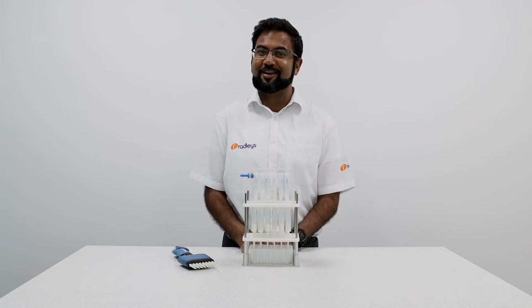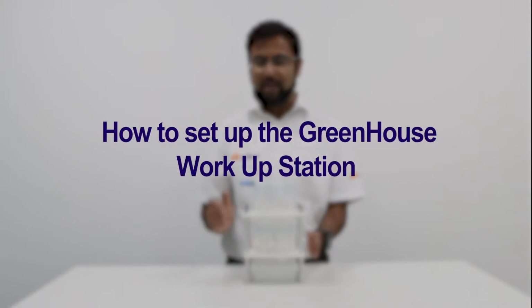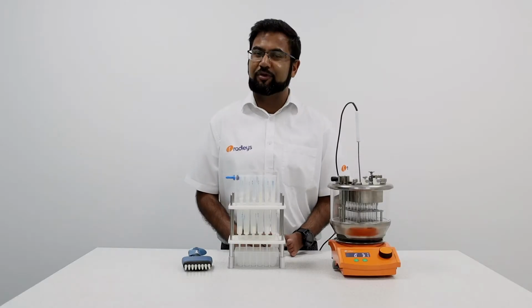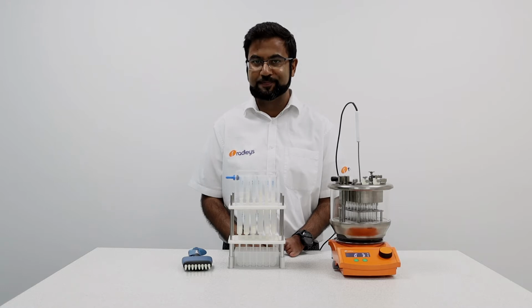Hi, in this video today I'm going to show you how to set up and use your greenhouse workup station. The greenhouse workup station was designed to make your parallel chemistry workups and purifications quick and easy.